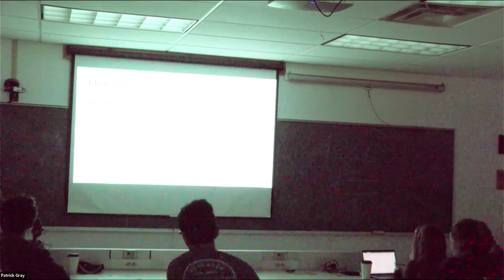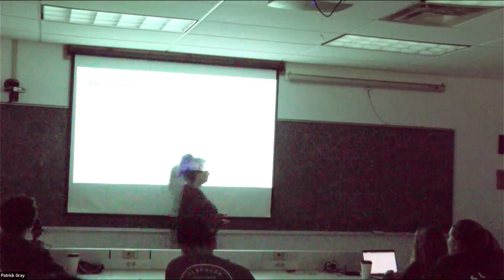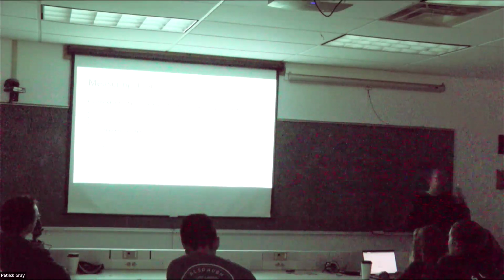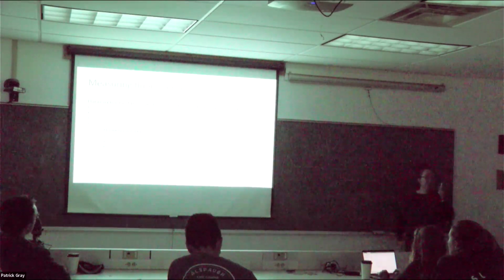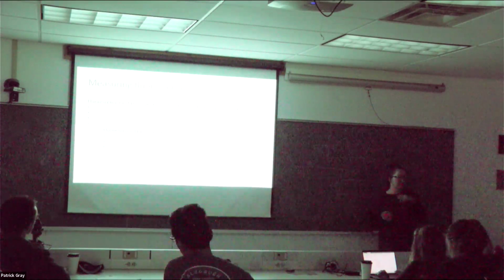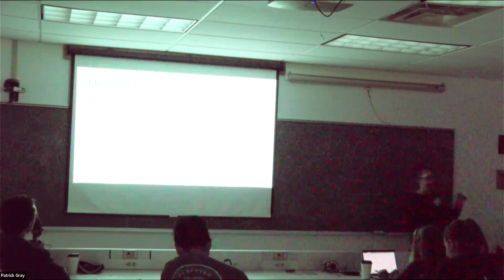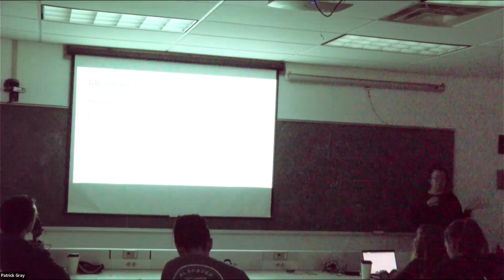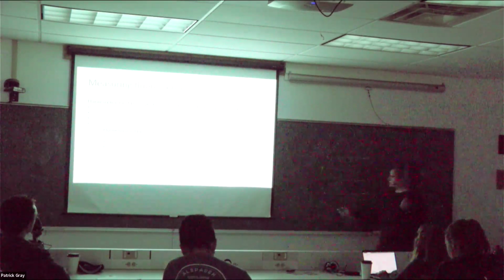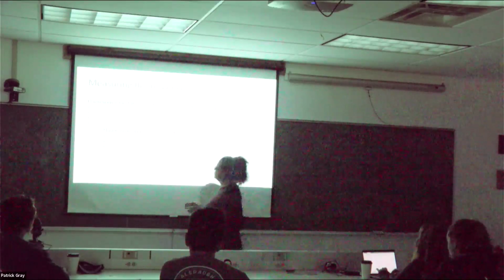Fluorescence emission spectrum. This is a little bit upside down, okay? So now I'm going to shoot one light source, one light, 440 nanometers, for example. And now I'm going to have a detector that's rotating through all the wavelengths. So that's going to tell me where the energy that I shot ends up. I'm searching where that drop happens. That's going to give me the Stokes shift. Where is my Stokes shift happening?